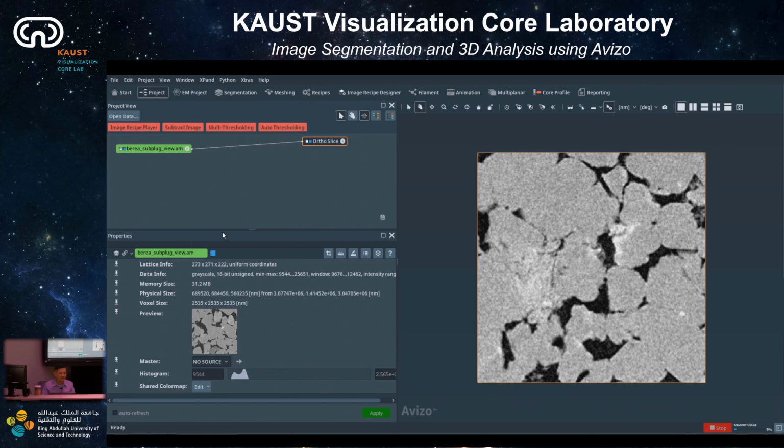For example, you look in the display folder. If you click on the display folder, on the right you can see a list of modules that can be attached to this type of data. Different data will show different types of modules that are available, because some modules only take grayscale, and some modules take only the label image. So just keep in mind that selecting the module depends on the data. Maybe you don't see everything available for this type of image.